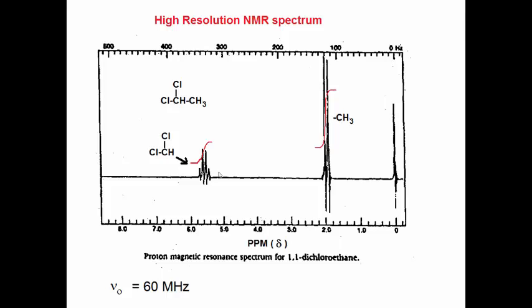Now let me try to explain from the ground up what's going on here with respect to spin-spin splitting, also called spin-spin coupling.